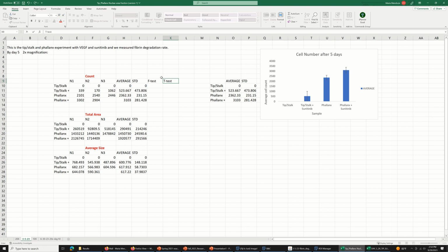And there's like a simple way to determine that, and that's like you get your variance. You get your highest variance and divide it by your low variance, and then if the answer is less than 4, then that means that your data is not highly variable. It's basically the same. It has the same variability, and you would do a type 2 t-test. And most of our stuff that we're working on is type 2 t-tests. So that's what we're going to go with today, just for today's video.